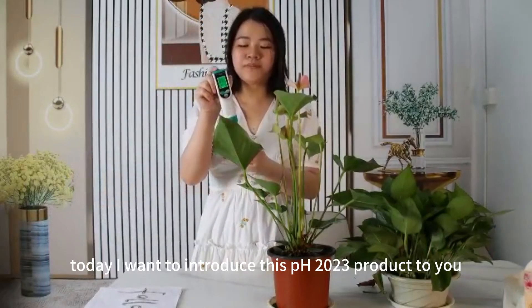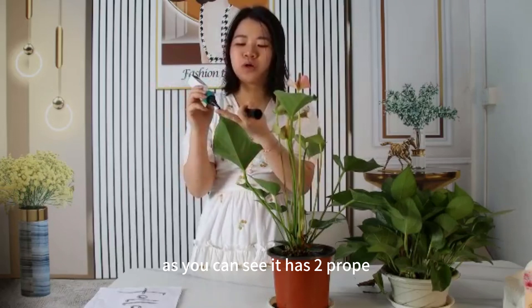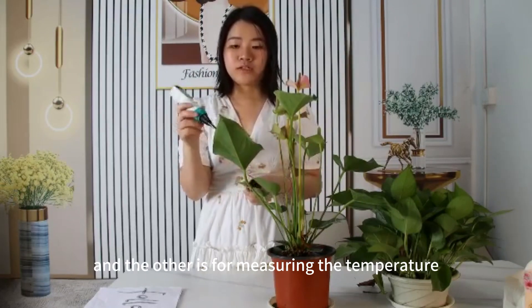Hello dear friends, today I want to introduce this PH2023 soil tester to you. As you can see, it has two probes — one is the glass probe and the other is the metal probe. They have two functions: one is for measuring pH and the other is for measuring the temperature.